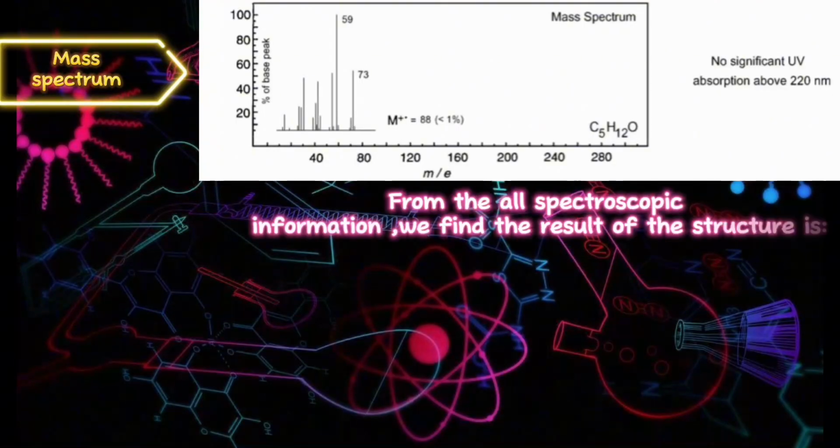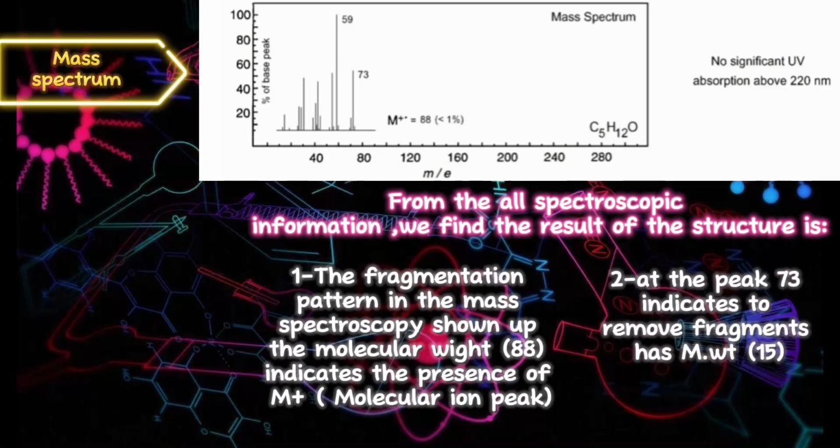It is the mass spectrum. Through this device, we can determine the molecular weight of the compound. The first peak indicates the molecular weight of the entire compound, and we see a peak at 73, indicating this one is the cation.